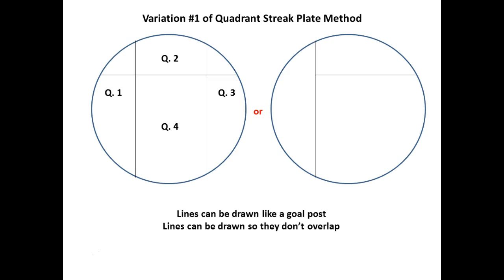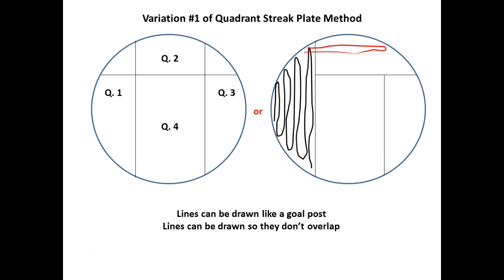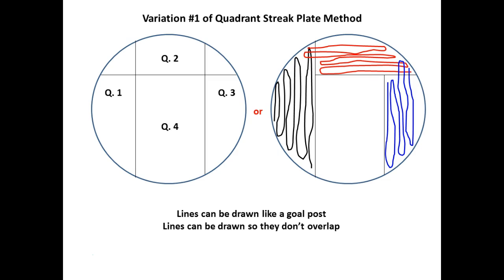So notice that one that went around with the yellow growth. You don't see any lines. I didn't erase them. There weren't any lines to begin with, right? But I still managed to do that pattern around the plate. So again, fill up one, grab to the next. You know, it's just helping you keep track of where you're going.